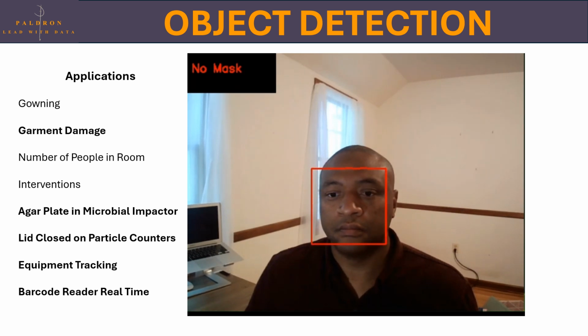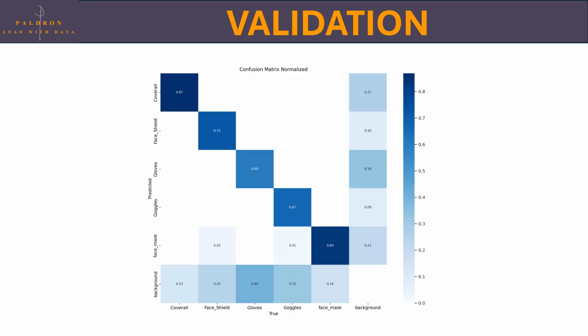upcoming updates. New technology is fantastic, but it really boils down to, can these systems be validated, and can you have accuracy? Can you have reproducibility? And how can you prove or demonstrate that? Well, that's the beauty behind this type of system. Once we create these types of machine learning models, we can look at, and this is really the heart and soul of what the validation would look like for this type of product, a confusion matrix.